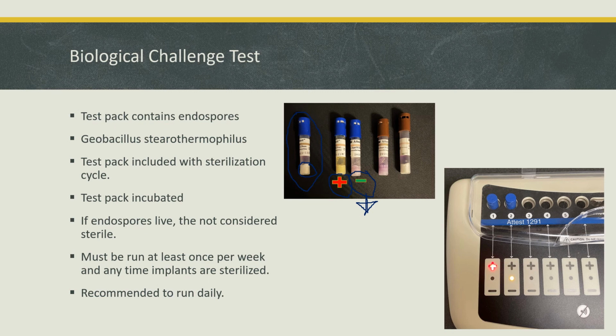They became living bacillus and began to grow. And so we know if the autoclave has killed all these endospores and they do not survive. So if the biological is negative, then most likely the autoclave is sterilizing everything on the inside. This is the only thing that gives this really quality assurance that it is sterilizing.